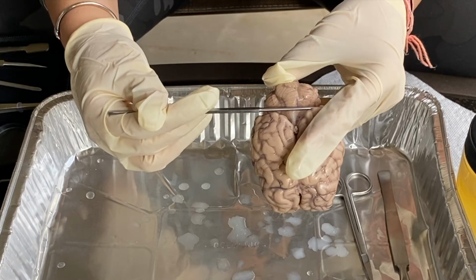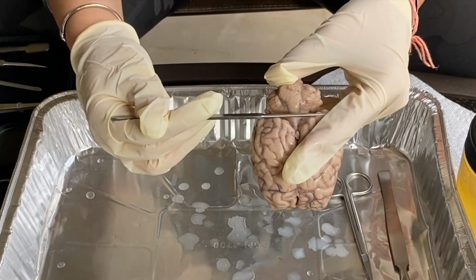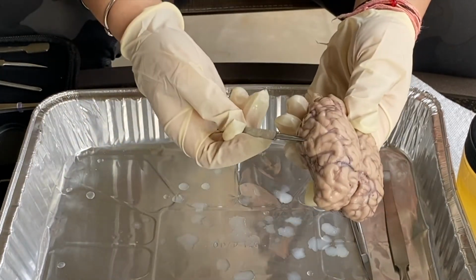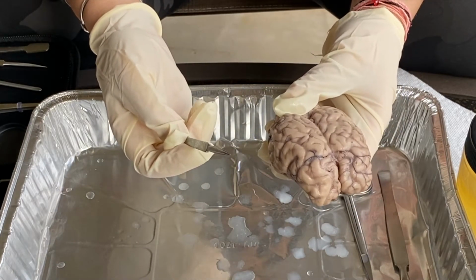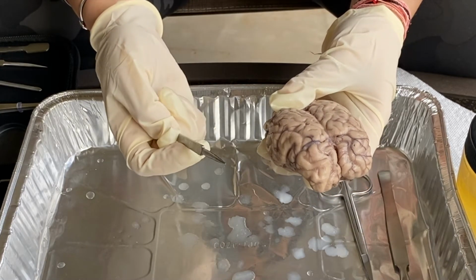Then you have your occipital lobe back here, and its main function is primarily vision. So for example, processing things like distance, depth perception, and color determination. And then we have our temporal lobes on either side, which are associated with processing auditory sensations and information, and plays a role in processing emotions, language, as well as visual perception.